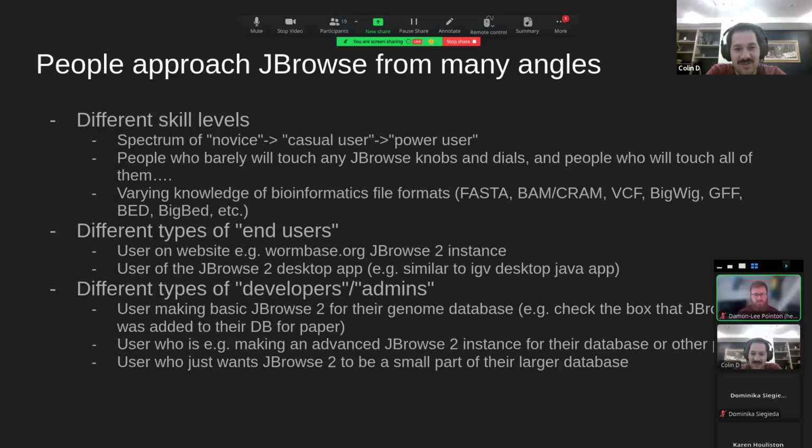You know, the end users, I just want to highlight that desktop is one of these interesting use cases where people can administer it themselves just entirely through point and clicking all the buttons in the interface.